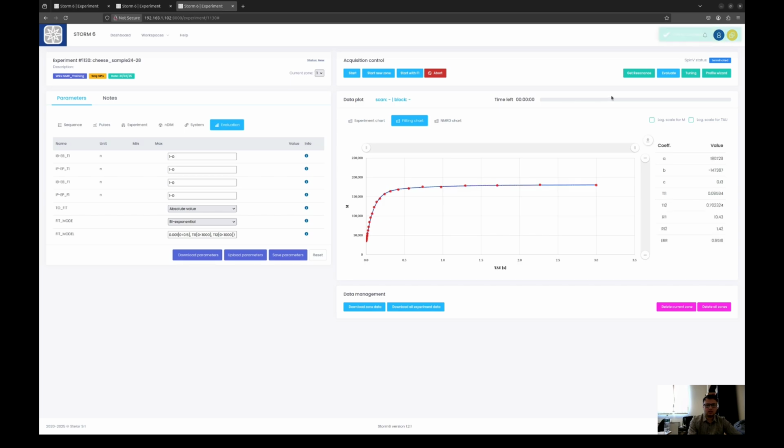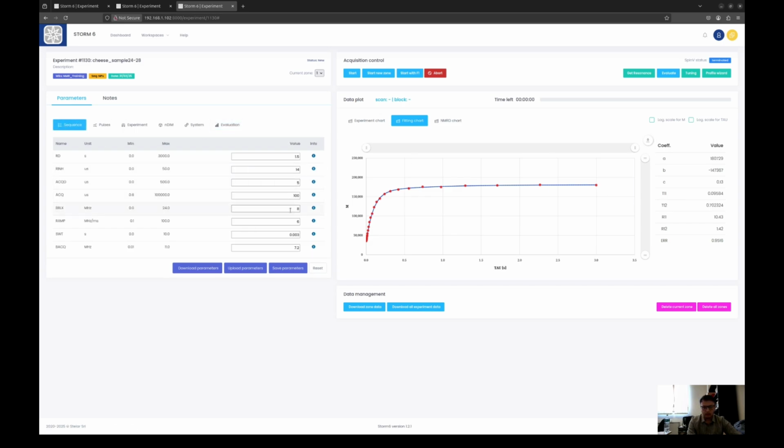So you see now we have T11, T12. At this field value, 8 megahertz, we have one component which is more evident, and then we have another component which is not that evident, and here it also tells us about its weightage.